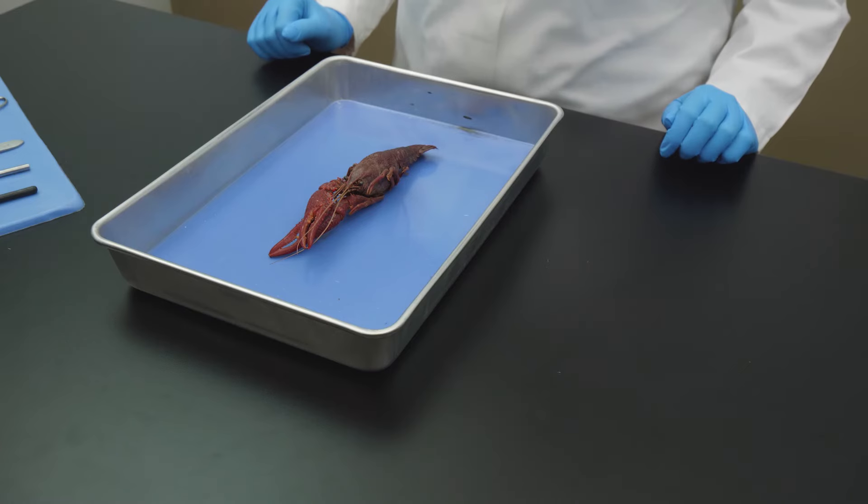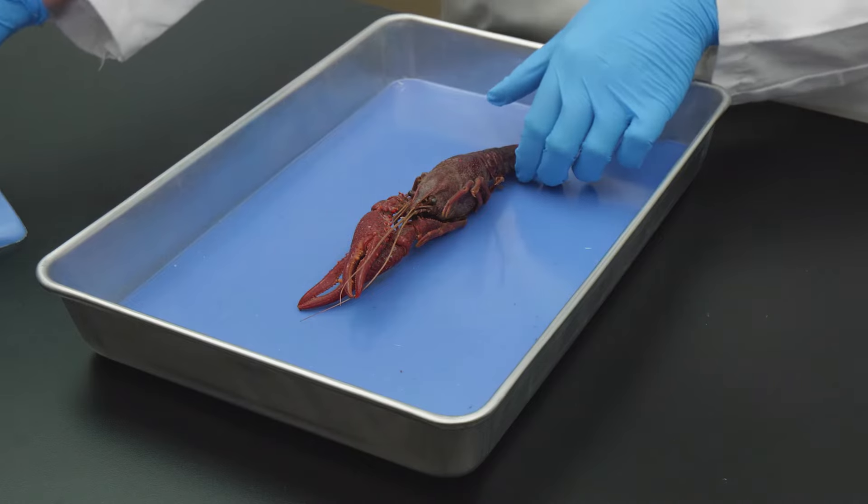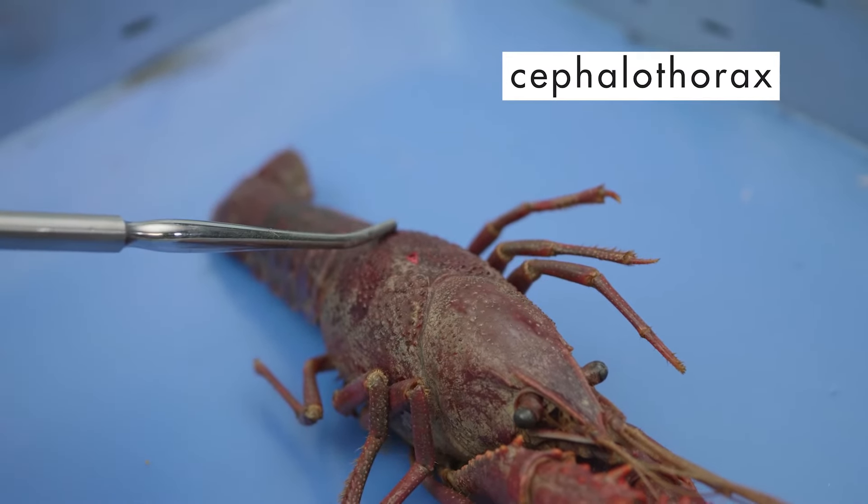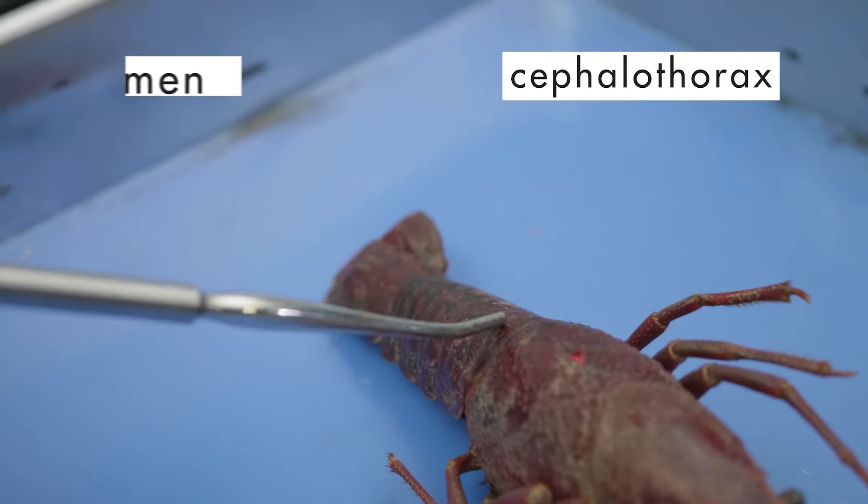The crayfish is a crustacean, which is a hard-shelled arthropod that is easily recognized by its two large claws. As we examine the external anatomy, we notice that the body of the crayfish is divided into two regions: the cephalothorax and the abdomen.